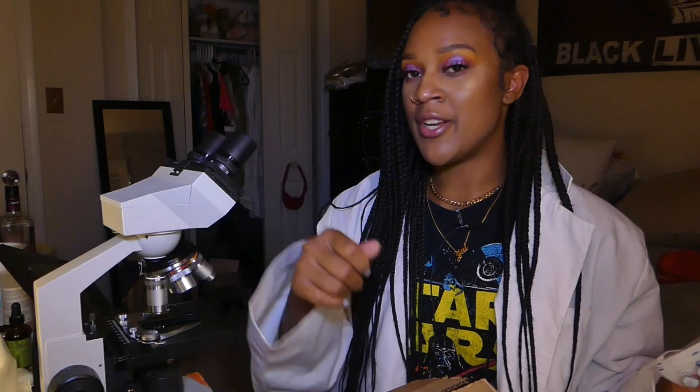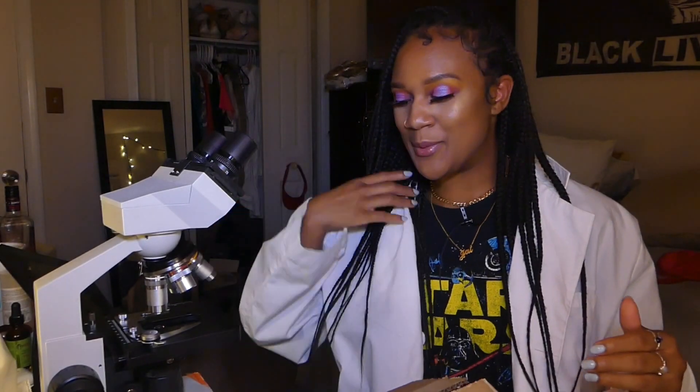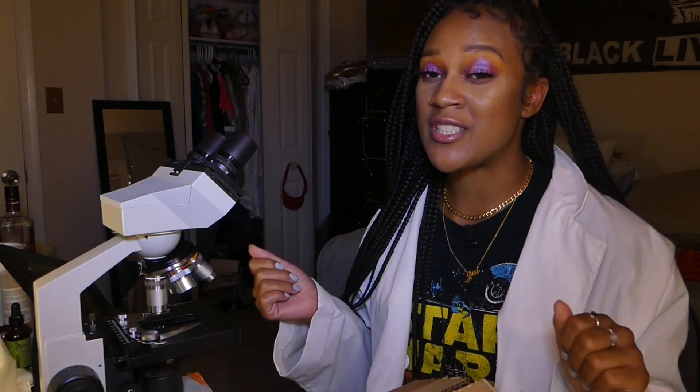What you do is spray the Q-tip with water, take your sample, swab it on the agar plate, and discard the Q-tip. After swabbing onto the agar plates, I closed them, labeled them, put the date on, put them in a box, and closed the box so they could incubate at room temperature for seven days.